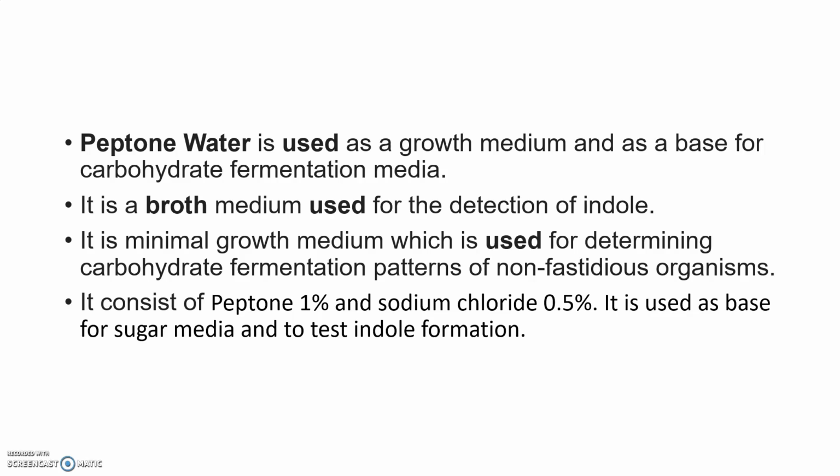It is a broth medium used for the detection of indole, and it is a minimal growth medium used for determining carbohydrate fermentation patterns of non-fastidious organisms.